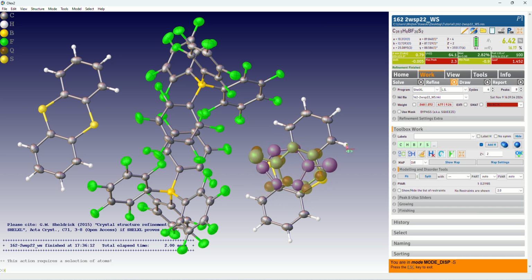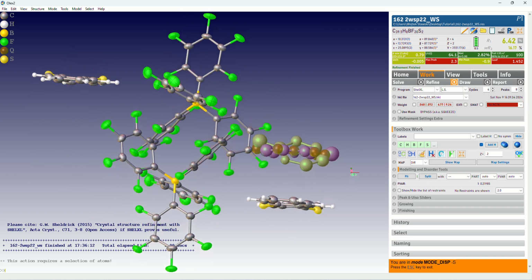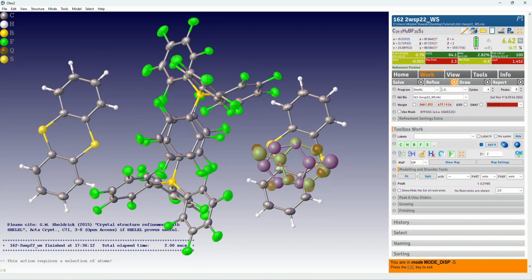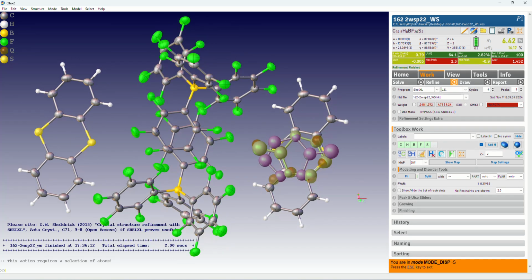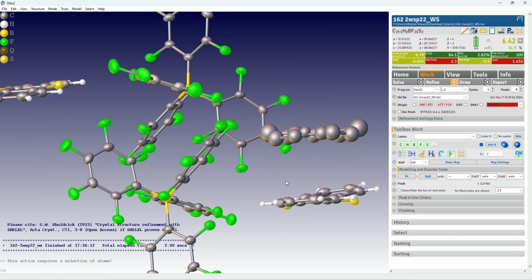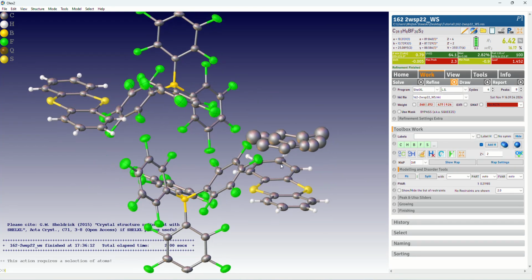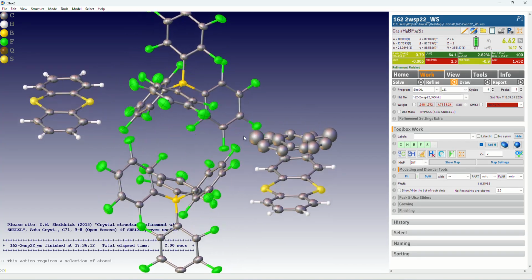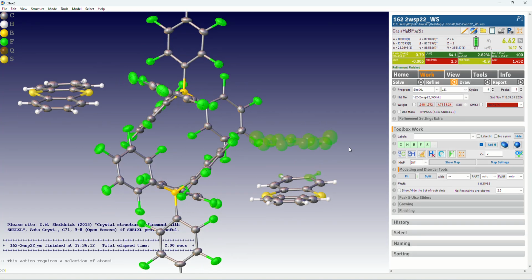I'll just rotate a bit. That didn't work. Okay. So like that. Should be more or less what we want, right? Okay, so we split the atoms. Again, let's do simu on all of them. Not on this.